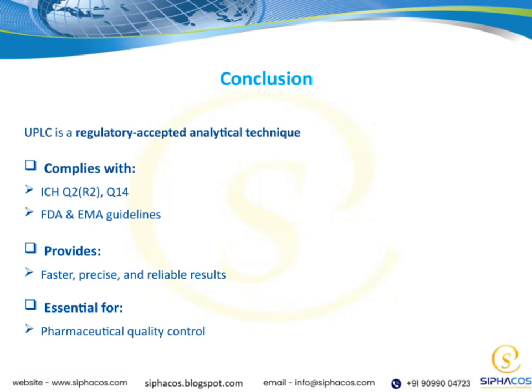So, in the context of this presentation, you can see how UPLC is a key tool in modern pharmaceutical analysis, meeting regulatory demands while delivering on performance.